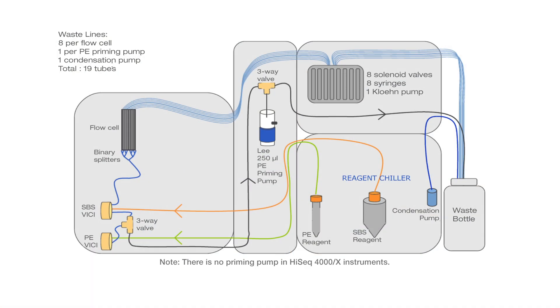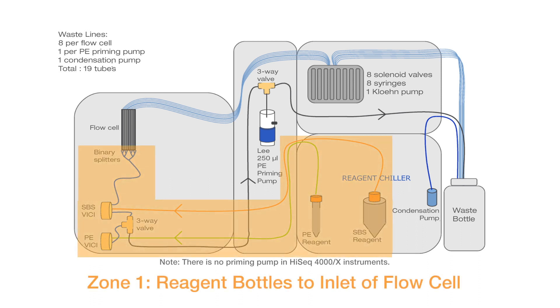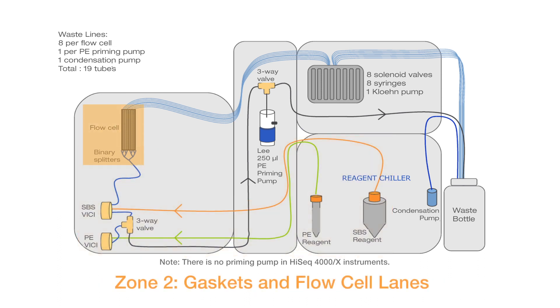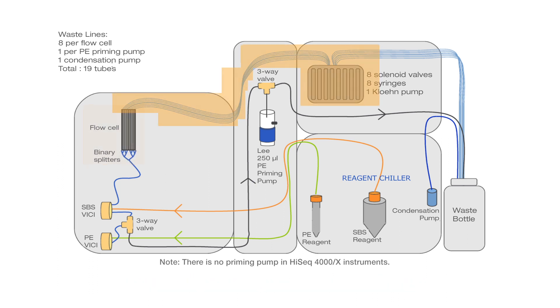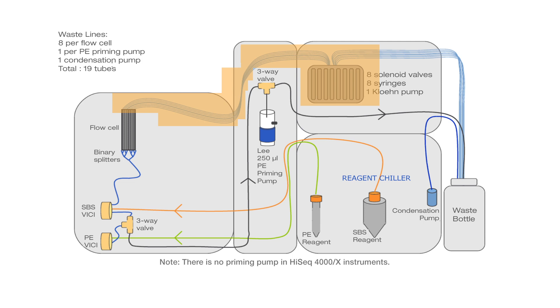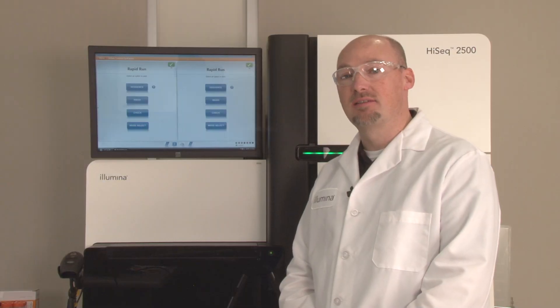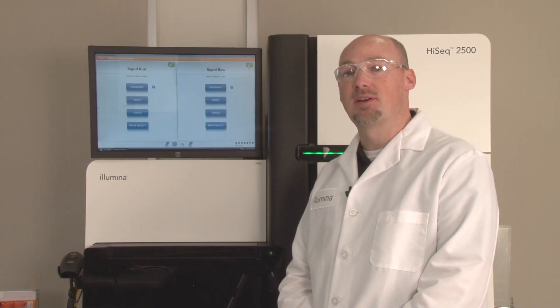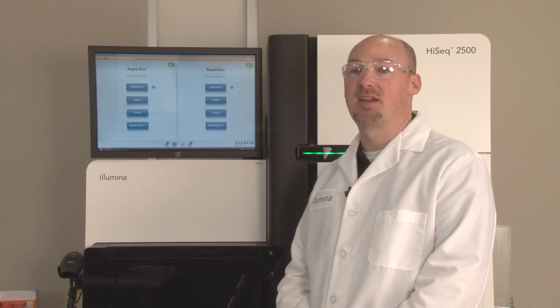To determine the location of the blockage, we investigate three general zones of the fluidics path. The first is from the reagent bottles to the inlet of the flow cell. The second zone is the gaskets in the actual flow cell lanes. The third zone is from the back or outlet of the flow cell to the syringes and out to waste. A good way to determine the location of your clog is to eliminate each of the three zones one by one as being a possible source.